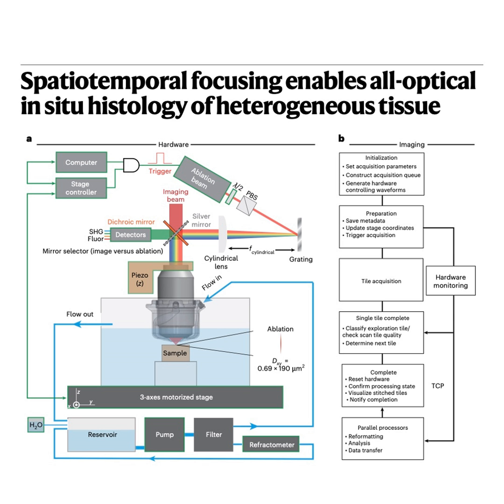You got it. You generate cavitation bubbles, tiny pockets of steam and plasma. And I bet those bubbles don't just disappear. Nope. They tend to accumulate, they stick to the objective lens, they stick to the sample surface, and once they're there, they scatter the incoming laser light like crazy. Blocking the beam, both for imaging and for further ablation. Exactly. The sources say this bubble accumulation can stop the continuous machining process dead in its tracks within seconds. Seconds. So you could never run this for the days needed to image a whole brain if bubbles kept stopping it. Absolutely not.